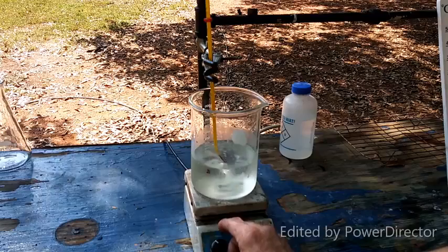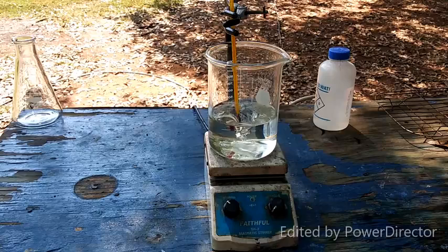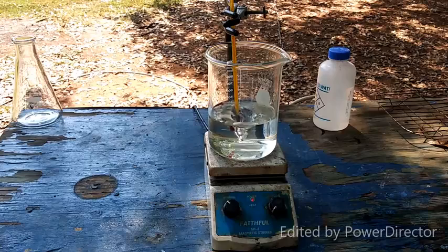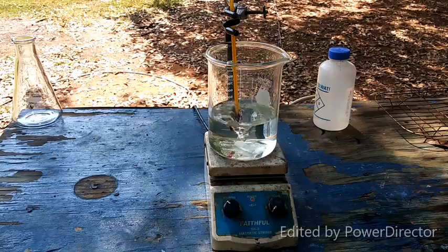Alright everybody, it's been about 15 minutes that this has been stirring. It's only hit 27 C, which is like a degree under the actual air temperature. But it did start off a little cooler than 10 C. So anyway, the next step is to heat this up to 80 degrees Celsius with stirring in order to complete the reaction. So it's going to hit that temperature one way or another.